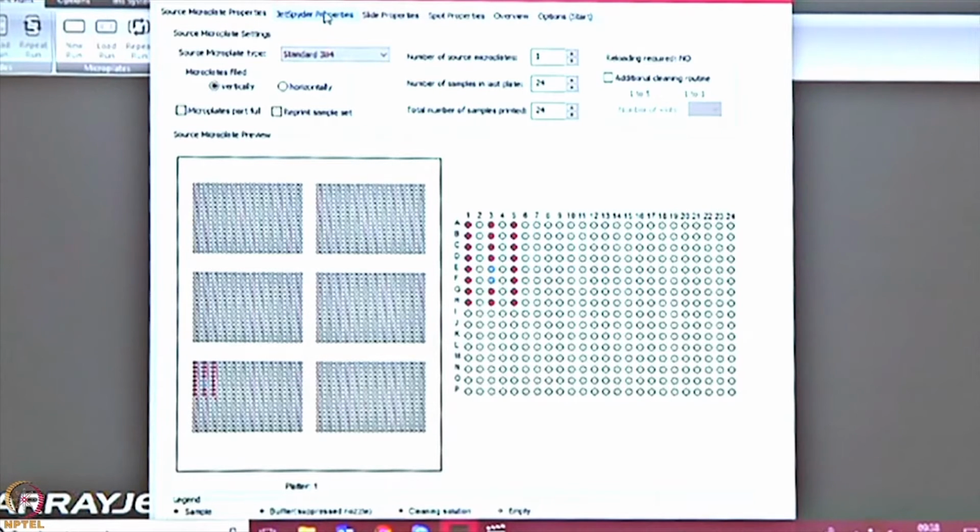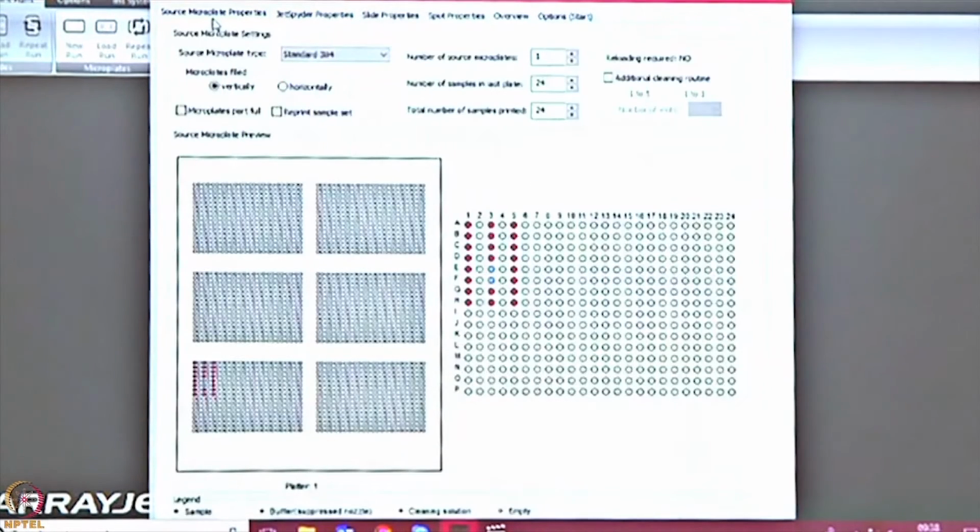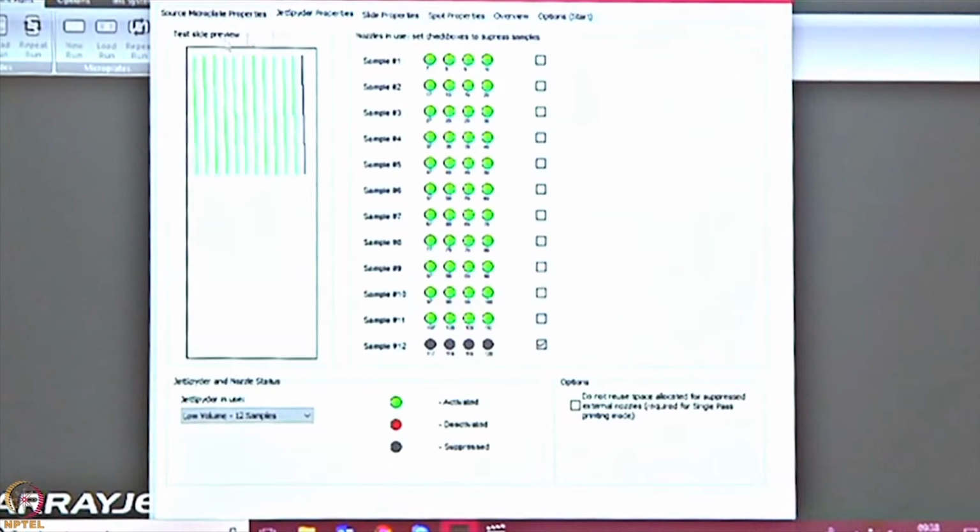So now I can print 22 samples because I was able to flexibly just go here, block 1, go back, 22 samples. If I wanted to just do 7, I had only 6 samples. I'll block all these. And now I've got only 6 samples that I'm working with.